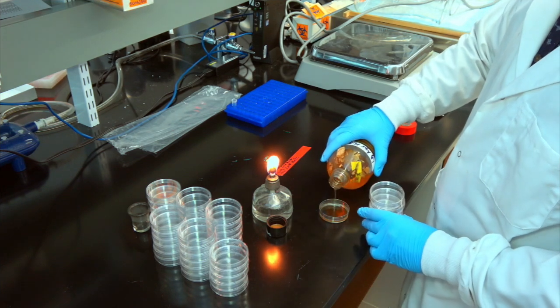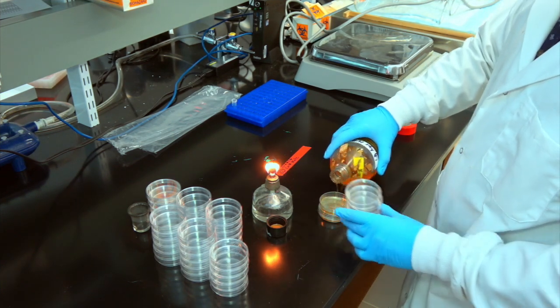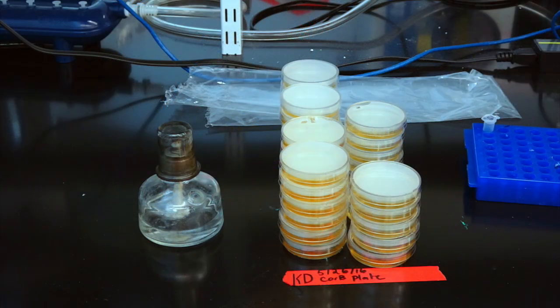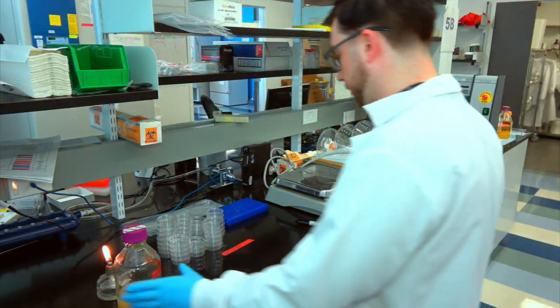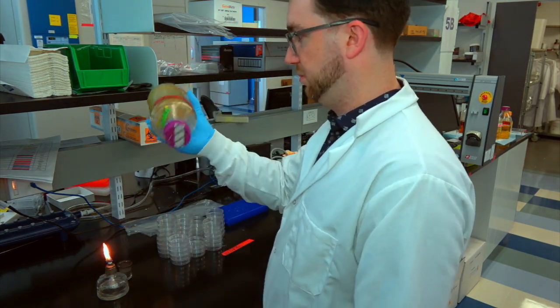As you pour your plates, be careful to recap them quickly, since that little flame certainly won't kill everything that could fall on them. We stack our plates in piles of about 5 as we pour. Make sure you swirl each plate after you pour it. If your LB agar partially solidifies, you should stop pouring and remake the gel mix.